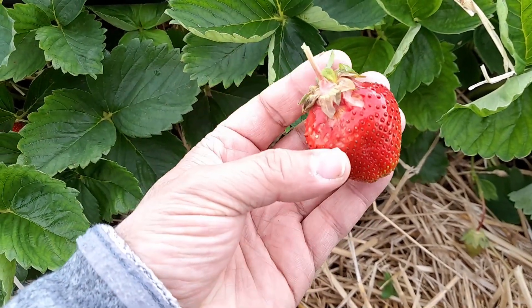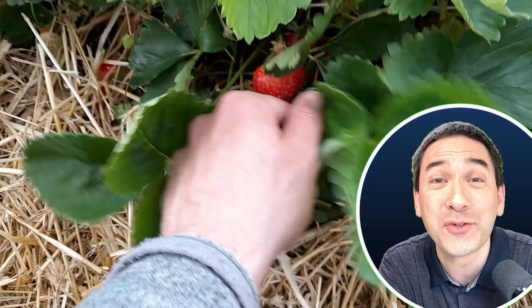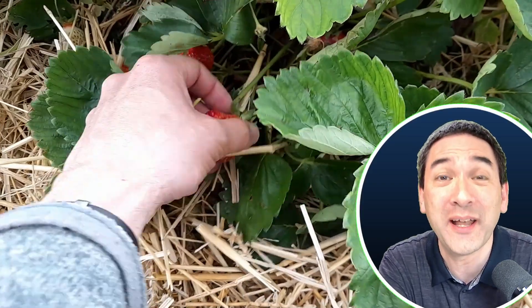Hi, hello and welcome again. Microbe Hunter here today. I'm going to put a strawberry under the microscope and this is what I found.